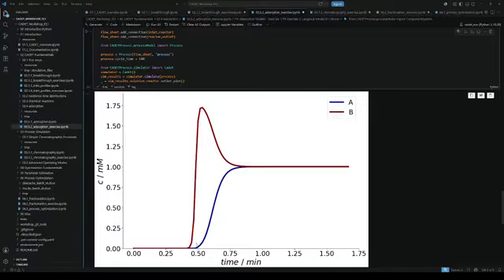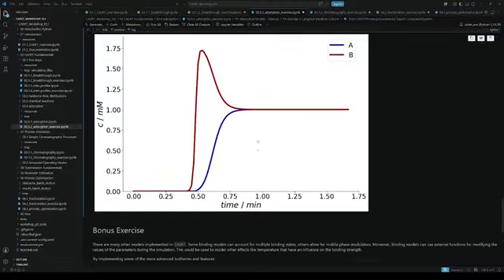And then since component A is binding more strongly than component B, it is removing component B from the surface, which is why at some point we have a higher concentration in the outlet than we even had at the inlet, because some of the molecules that were bound are already being removed by A until all of the system is saturated at some point.